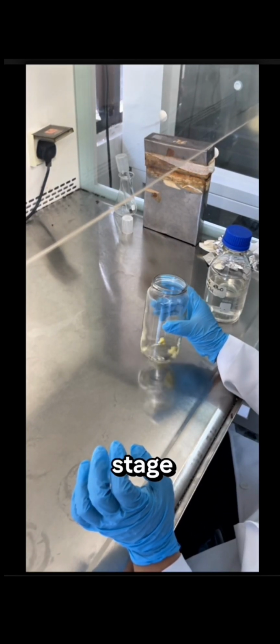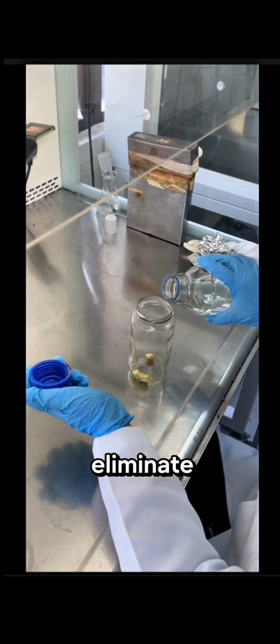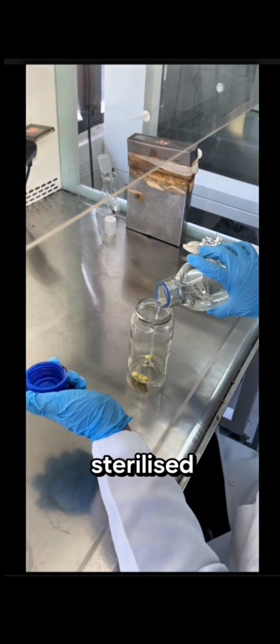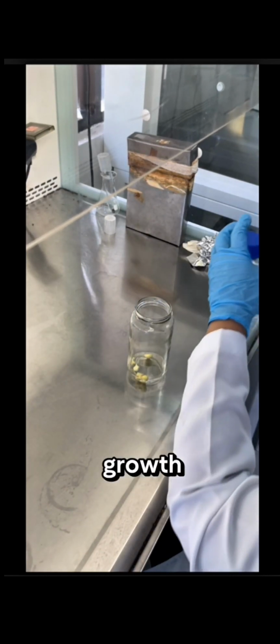First, initiation stage. This stage involves the surface sterilization of the explants to eliminate any microbial contamination. Once sterilized, the explants are transferred into a suitable culture medium to initiate growth.